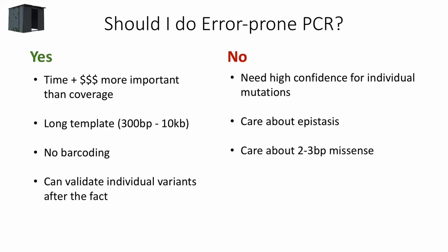I don't want to take the extra time and effort to do that. Or maybe I've got a really long template and I don't want to get really long sequencing reads. In particular, it's good if you want to pull out winners from a selection, get a few variants that you really care about, and then go back and validate those after the fact. It can be a really useful way to do that.